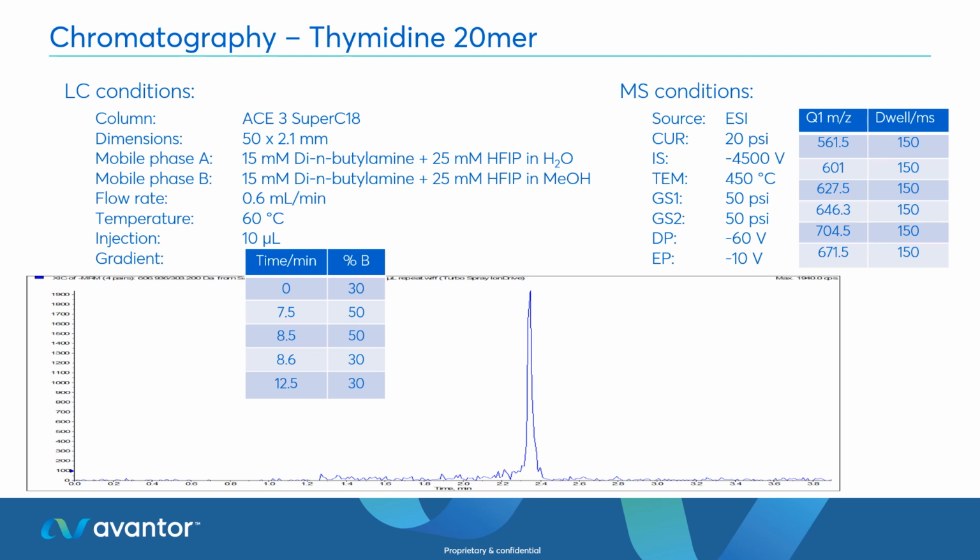We're running in negative mode on electrospray. We're looking at several different transitions so that way we can capture fully the oligonucleotide as it comes through.